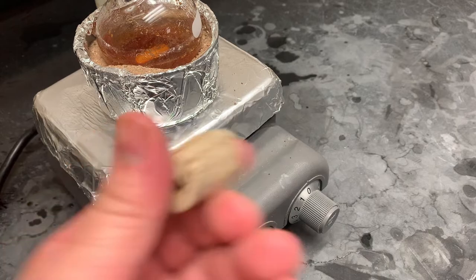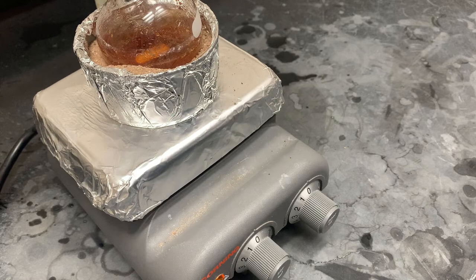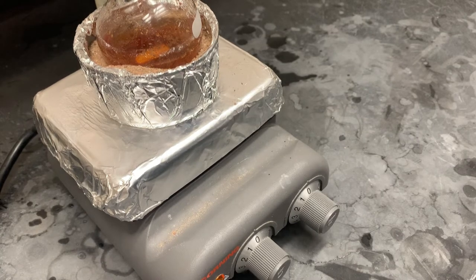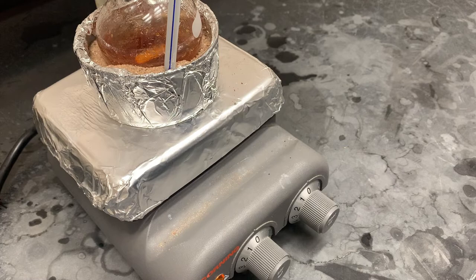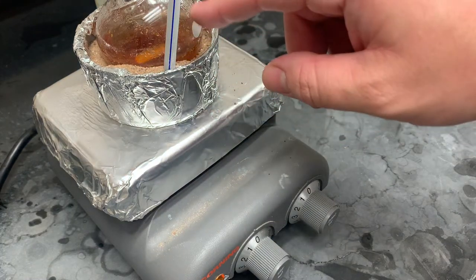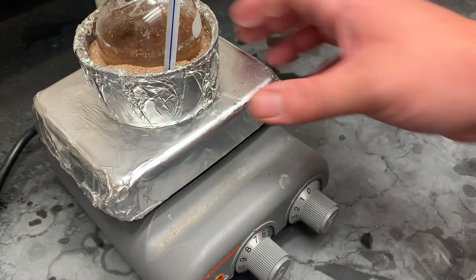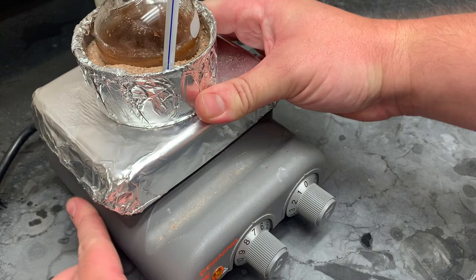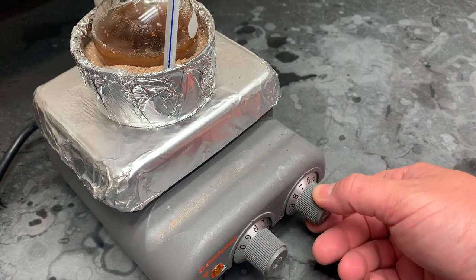We're also going to need either a rubber thermometer adapter or a split cork, and we're going to have our thermometer on that. That's for our sand bath. Clamp that, too high, lower it into position, adjusting angles as needed. We want that just below the level of the sand, as close to our round bottom as possible, and get that stirring a little bit off center. So we recenter that and turn the heat on.